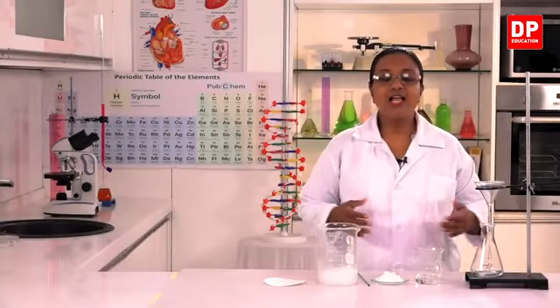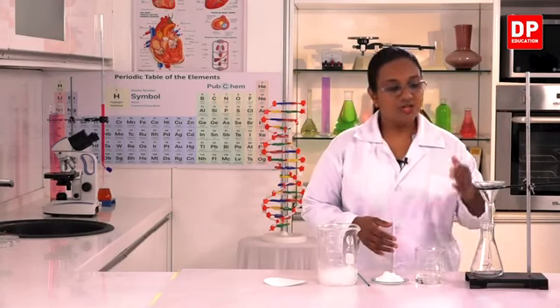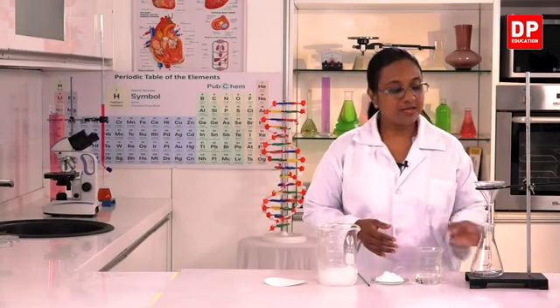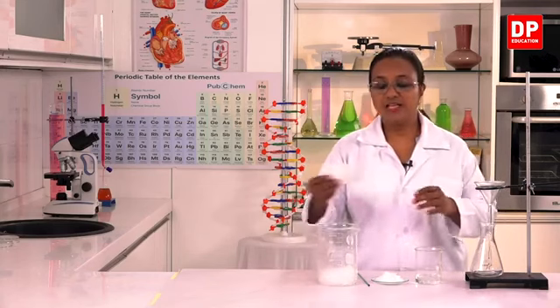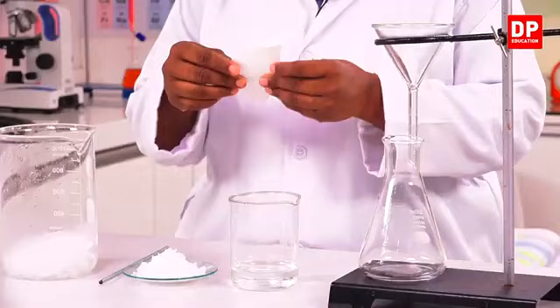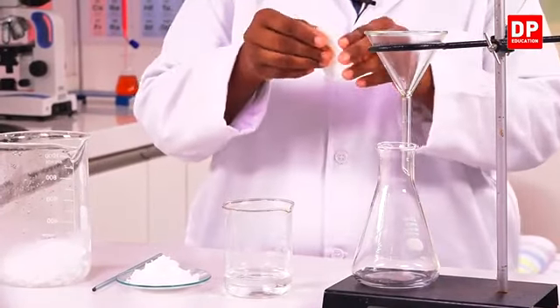Okay students, now I am going to do the recrystallization process. To do this, I have the setup here with the funnel placed on the stand. Into the funnel, I need to place a filter paper. I have to fold it and place it inside the funnel.